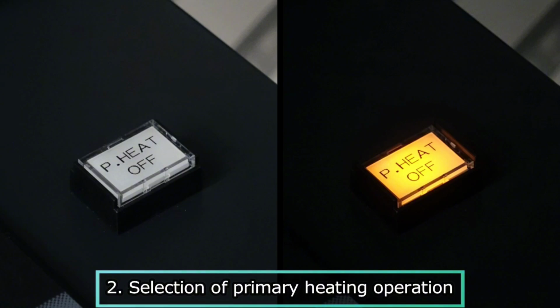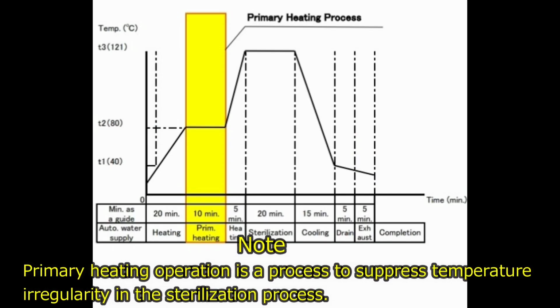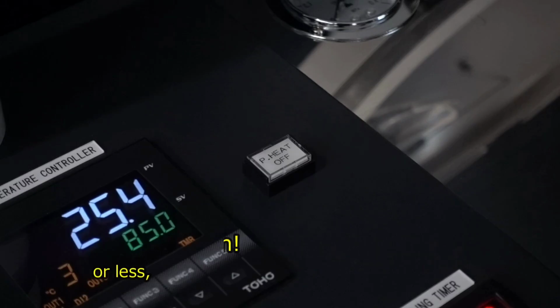Selection of primary heating operation. Primary heating operation is a process to suppress temperature irregularity in the sterilization process. Basically, the default value 80 degrees Celsius, 10 minutes, 0.030 megapascals is used for primary heating operation. To perform primary heating operation, turn off the P. Heat OFF button.